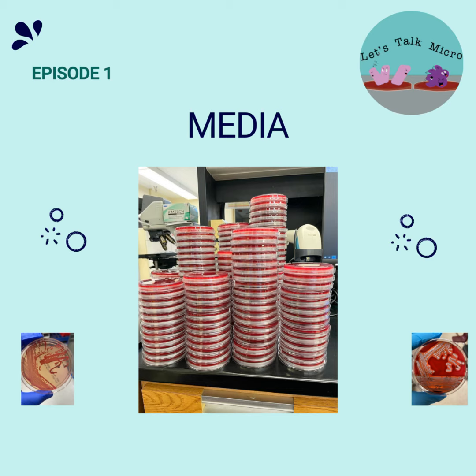And they need moisture. So they need water for certain metabolic pathways. And even though the media actually has a lot of water in it, when we put it in the CO2 incubators, they start drying. So in order to keep that moisture, you add water to the incubators. So if you're ever wondering why you have to put water in the incubator, it's just so you can keep this moisture, because the organisms need it.